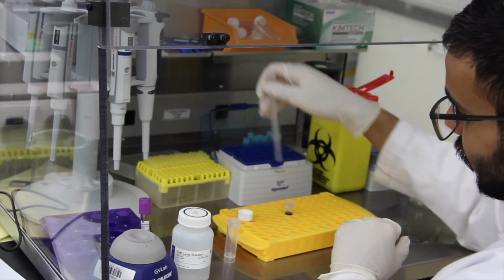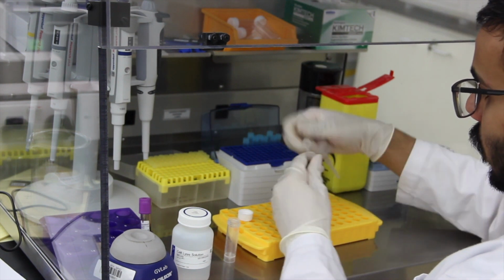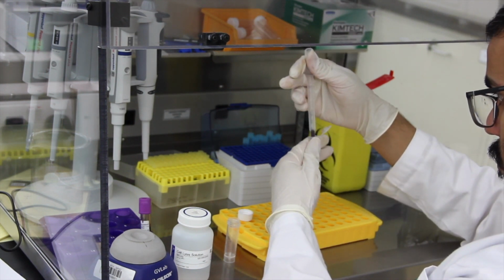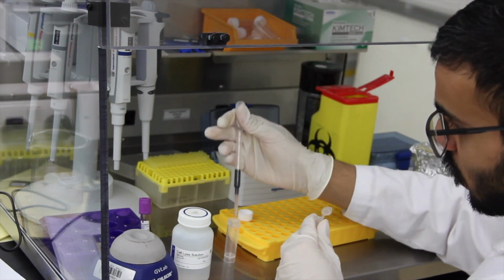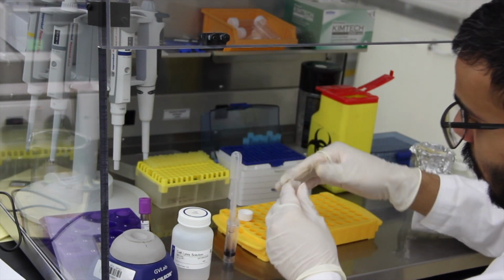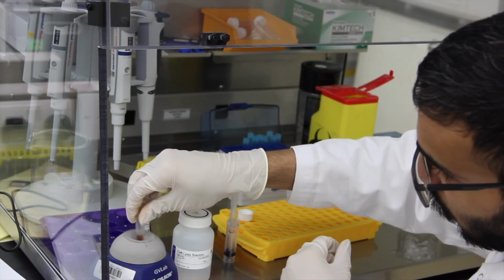Notice the white pellet at the bottom of the tube. If it is there, discard the supernatant, leaving only 10 to 20 microliter of residual liquid with the white pellet. Then, resuspend the white pellet in the residual liquid.